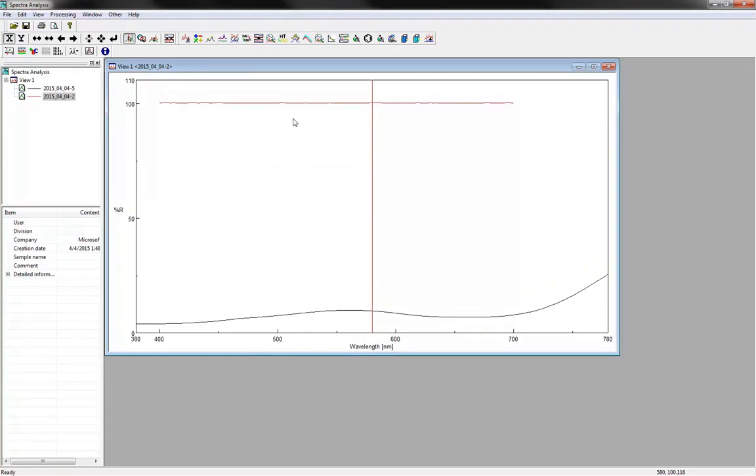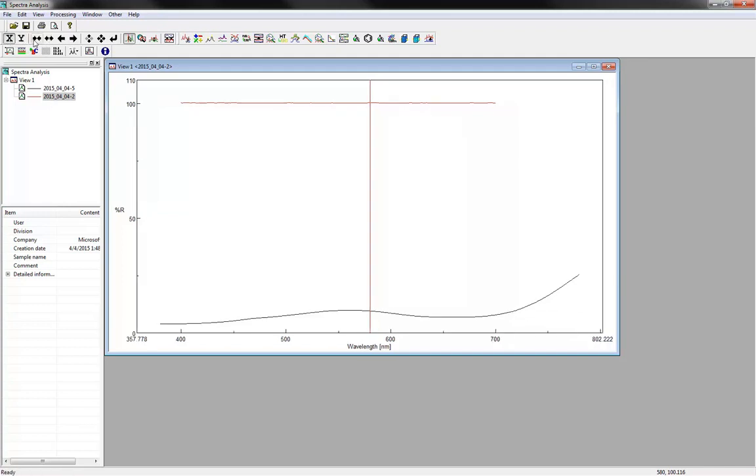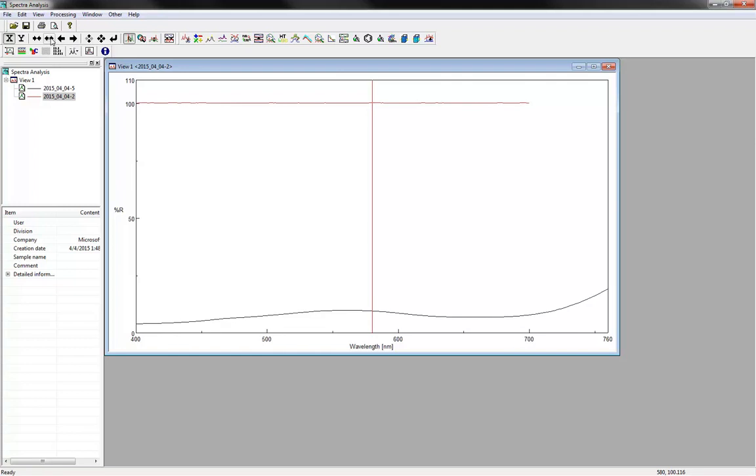There are numerous zoom options which allow you to better view regions of your spectra. In the View toolbar, you must first select which axis you want to edit. Clicking X modifies the X-axis scale setting, and selecting Y modifies the Y-axis. The Zoom Out icon reduces the spectrum horizontally or vertically depending on which axis you select. The Zoom In icon expands the spectrum horizontally or vertically.